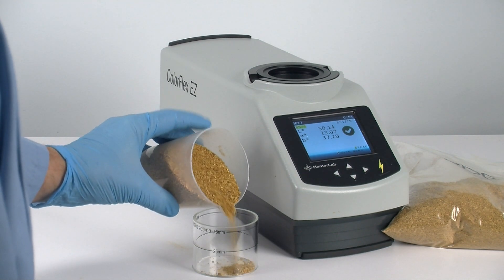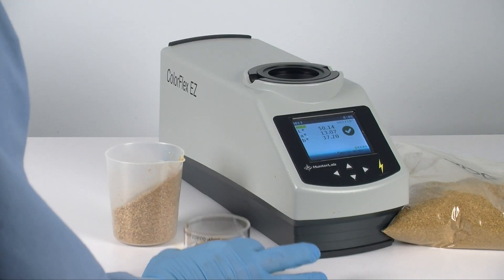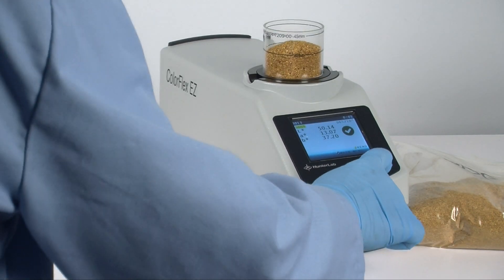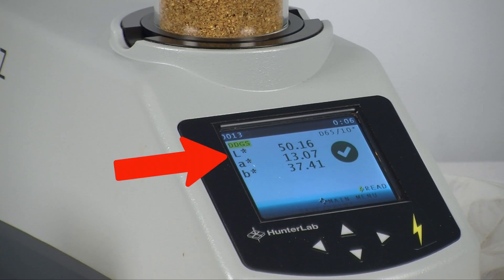First, simply pour your sample into the sample measuring cup. Next, place the sample onto the sensor port. Press Read to take the measurement. In less time than it takes to read this, the measurement is made, and you know both your sample's L-Star value and if it's in your predetermined acceptable range.